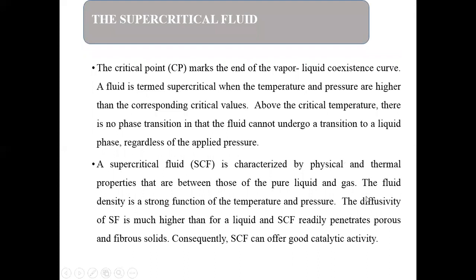Here is the discussion on what is meant by critical point. The critical point marks the end of the vapor-liquid coexistence curve. A fluid is termed supercritical when the temperature and pressure are higher than the corresponding critical values. Above the critical temperature, there is no phase transition, in that the fluid cannot undergo a transition to a liquid phase, regardless of applied pressure.